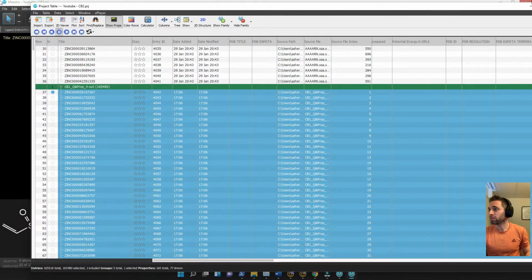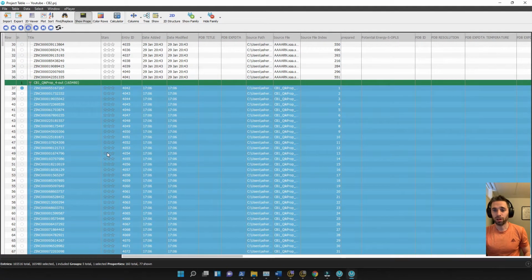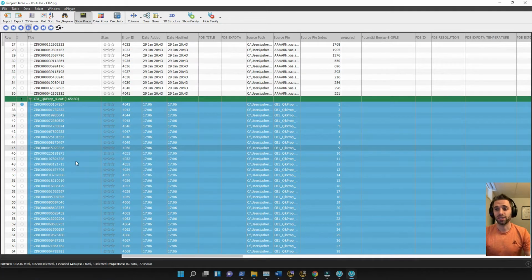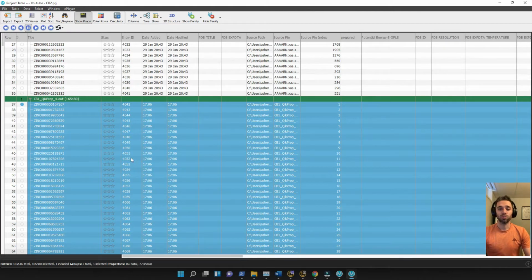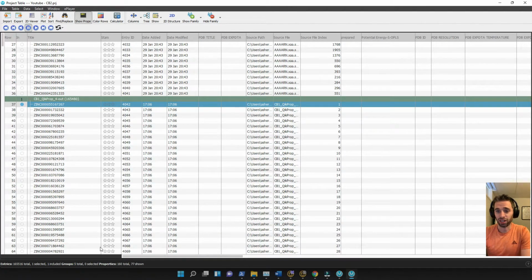We've got our file open, our QikProp job. What we have to now do is delete compounds that we do not want, that have properties which will not get into the central nervous system. Although CB2 is primarily located on immune cells inside of the body over the brain, I want to look for a CNS active drug, one that gets into the brain. So we'll click one of the entries, and that'll select one of the entries in this QikProp job.